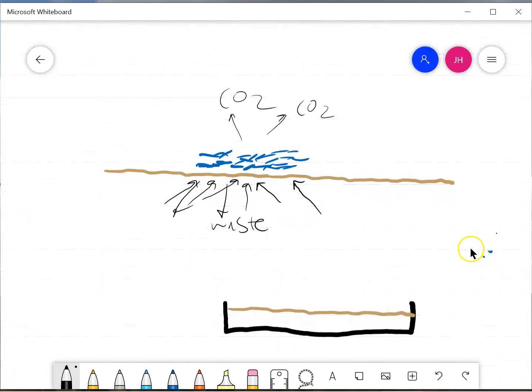And so we can zoom out a little bit and just remember, if you put a cell down here, it's microscopic, and then it starts to grow on the surface until you can see a colony. And you did it over here too. You can see a colony over here. You can see some here and here. And again, this would be a circular petri dish. If we were looking from above, we'd see a circle, but we are at its level. We are like crouched down looking over the surface of a table, and this is sitting on it. So this is the surface of the agar. These are the colonies on the agar.